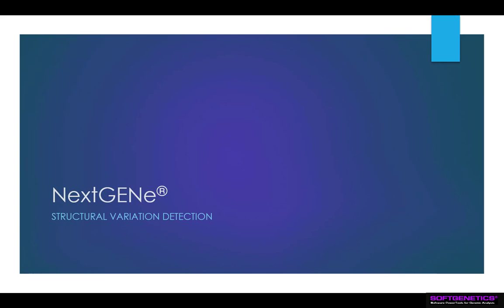Thank you for viewing this webinar on structural variation detection with NextGENE software. We'll discuss the structural variation detection algorithm, settings, reporting, and we'll review some demo data.